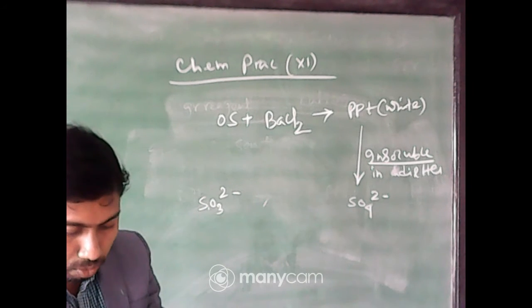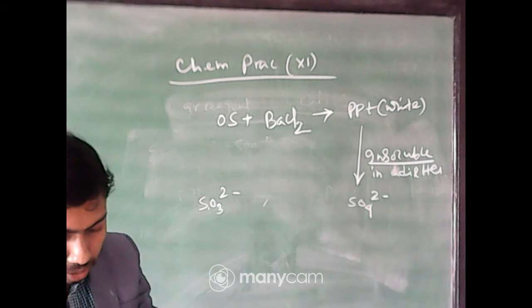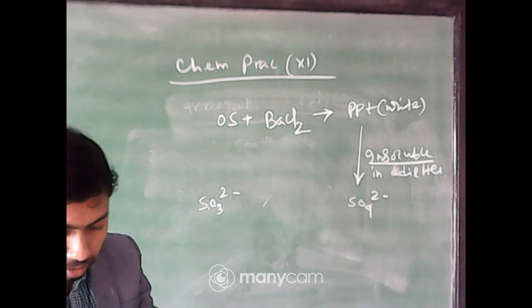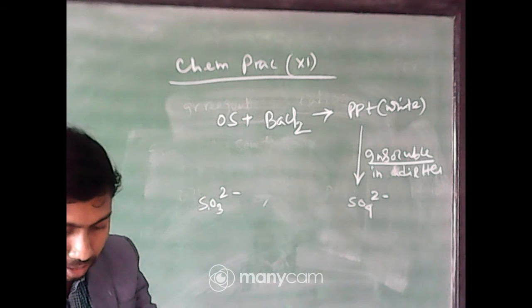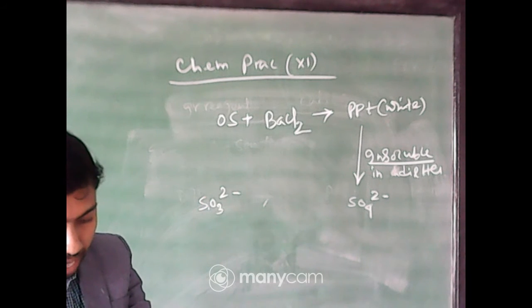Now, we will move to the theory of that test. So, first one, that is for aluminium. The PPT that comes is of aluminium hydroxide.